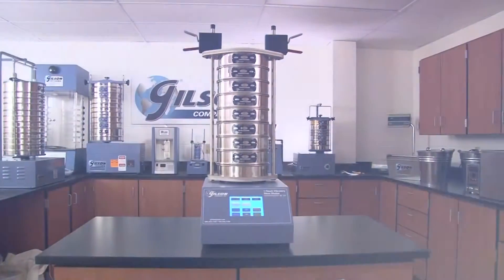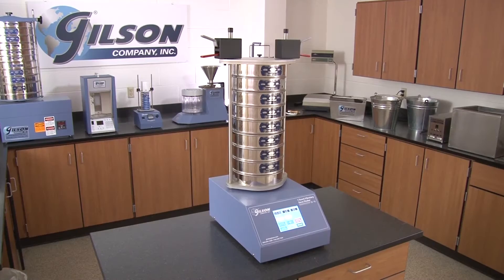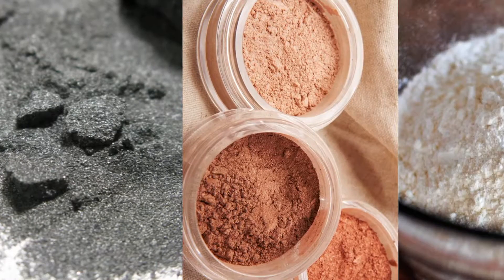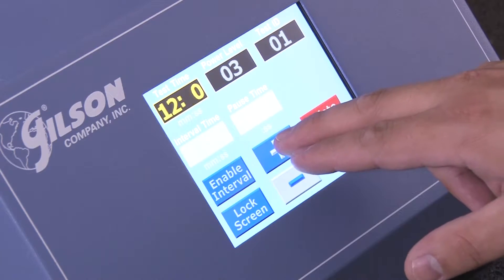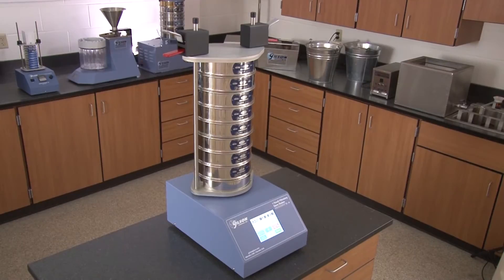The Gilson SS10 One-Touch Vibratory Sieve Shaker is ideal for powders and many fine granular materials including minerals, pharmaceuticals, metals, and cosmetics, and combines the latest in electronic control with proven separation technology for fast, accurate separations without the loud and frustrating tapping noise.